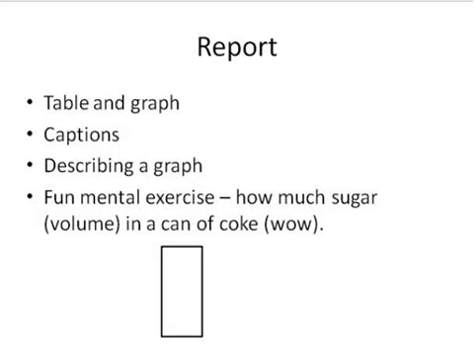You will have to make a table of data, and you will have to make a graph. And both of these things will be made in a word processing program, most likely Microsoft Word. So as stated in the last report that I talked about, you will have to actually create a table, and you will create a table caption, and you will create column headings and row headings. We give you an example of a possible data table in the lab manual, and so that's a good place to start. Kind of gives you a feeling for what tables, headings and stuff look like.